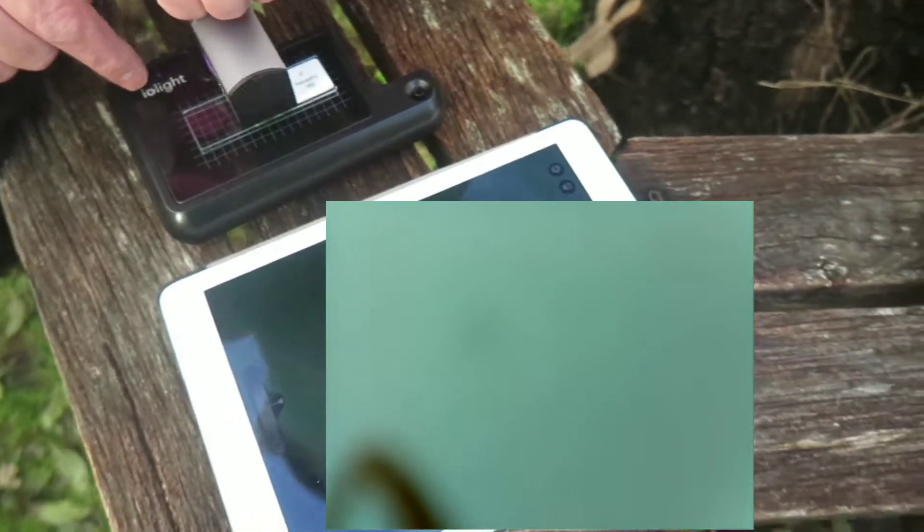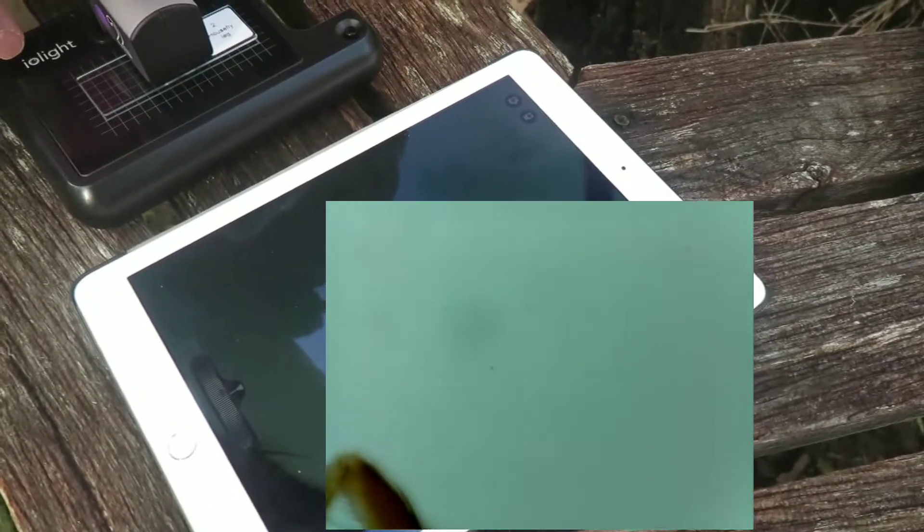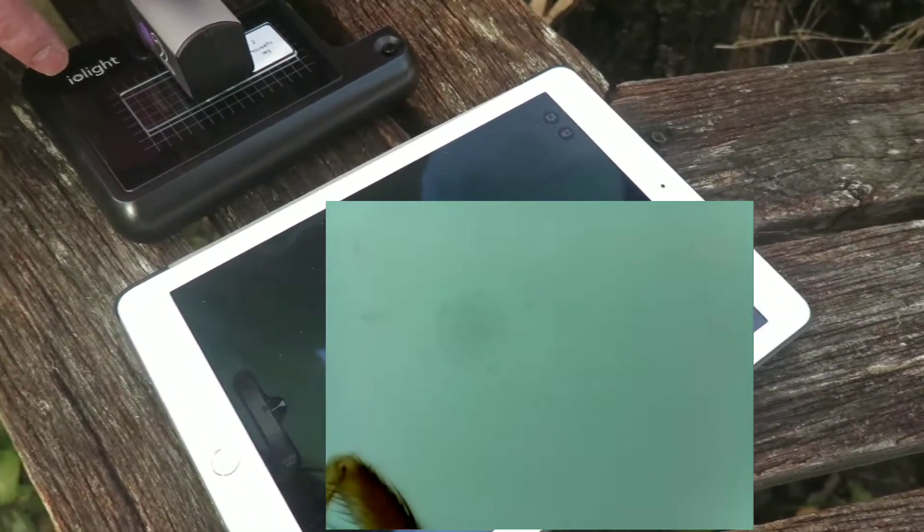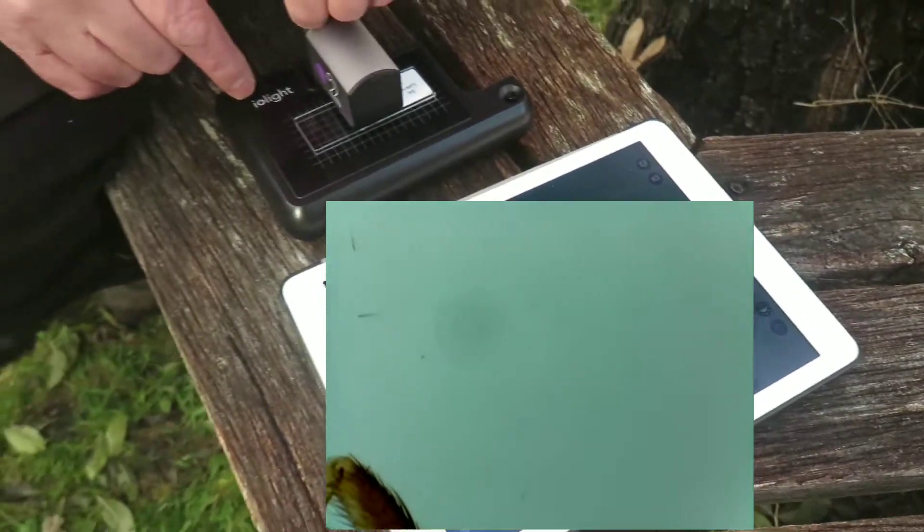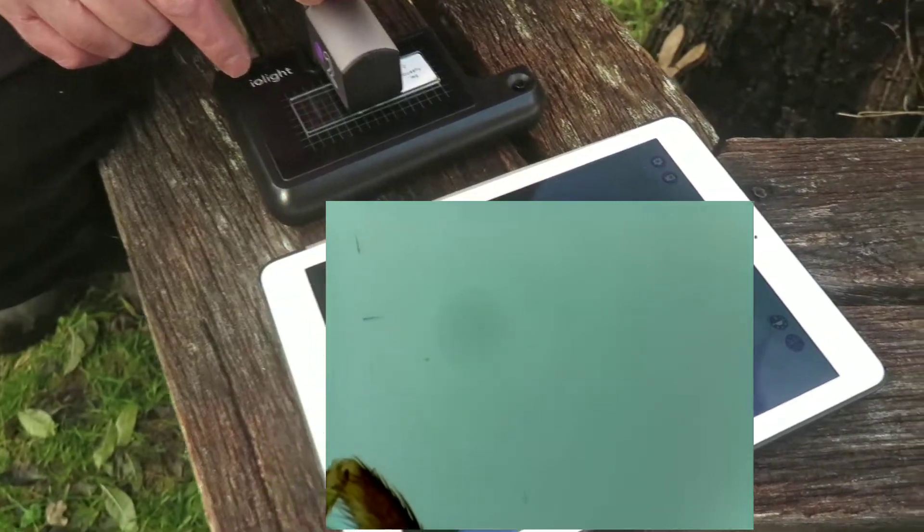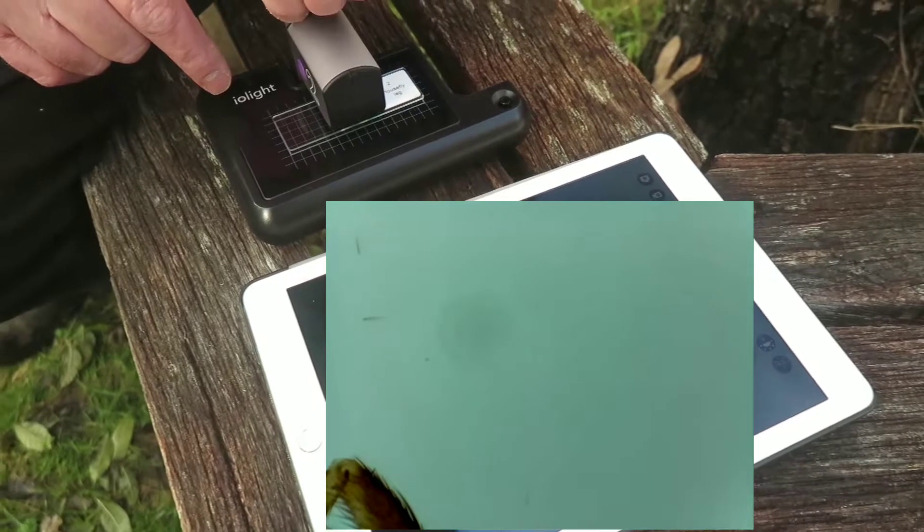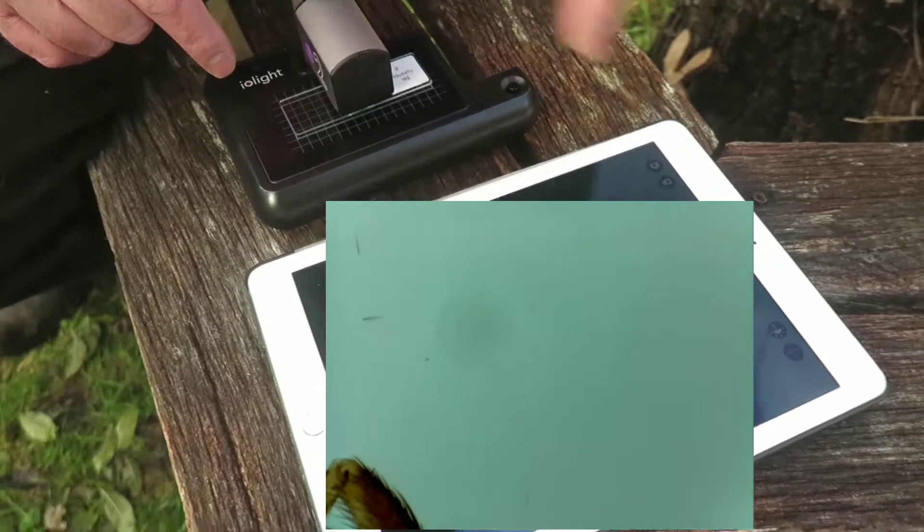We can't see what it is yet because the slide's in the wrong position but you can see if you look here that the image is pretty well in focus and I've done that just by moving my hand on the microscope head.